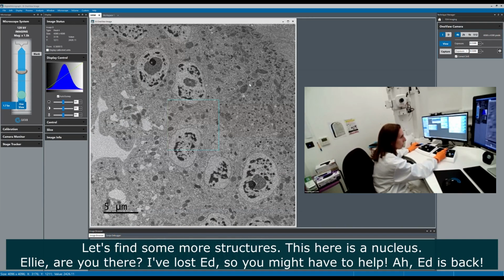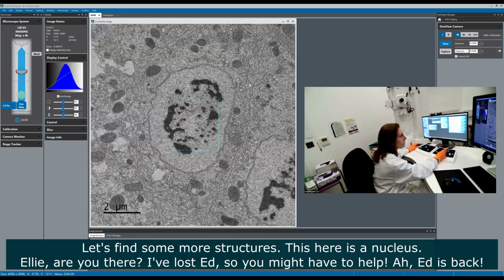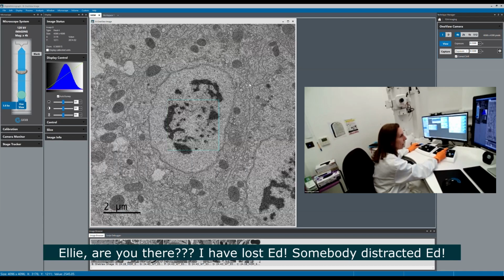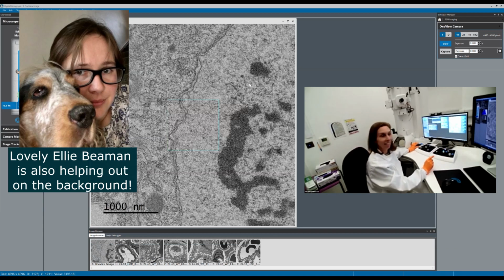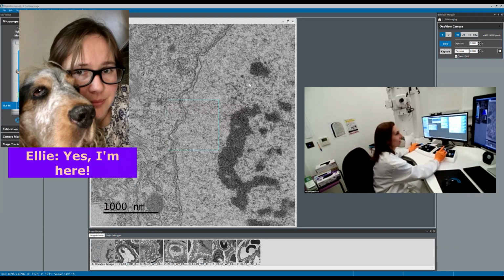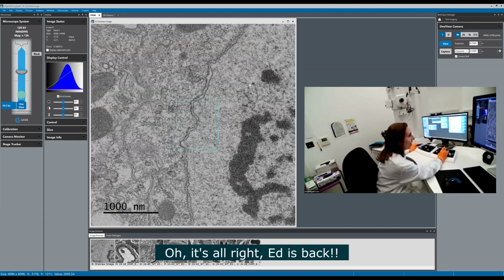Let's find some more structures. This here is a nucleus. And Ellie, are you there? I have lost Ed. Somebody distracted Ed. That's all right. Yes, I'm here. Oh, it's all right. I was going to ask you to help me, but Ed's back.